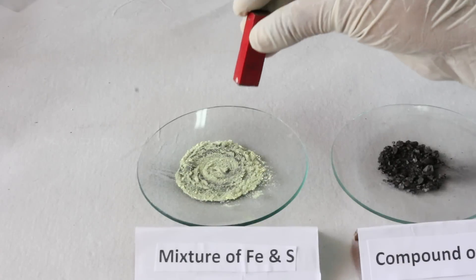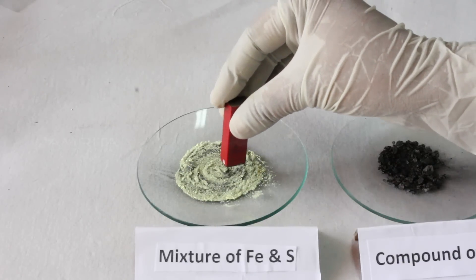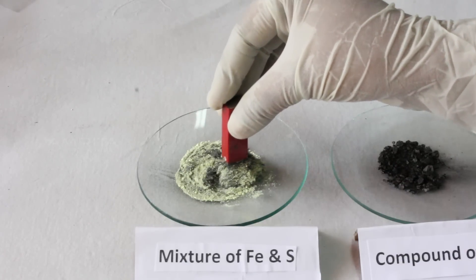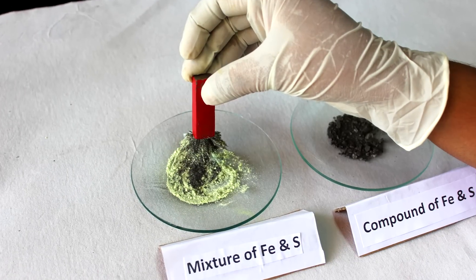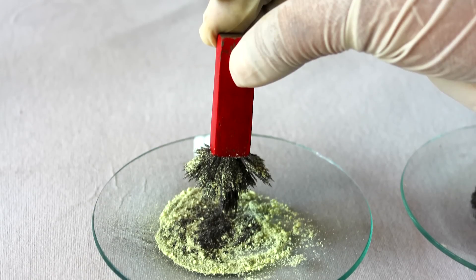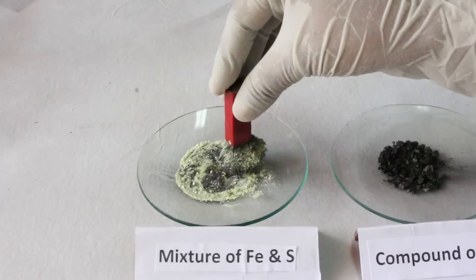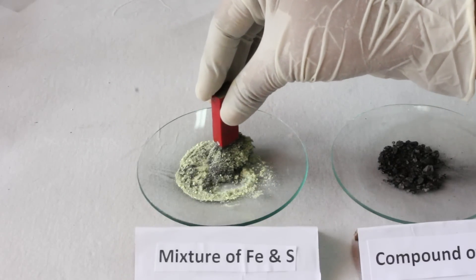Now, show a magnet over the watch glass in which the mixture of iron and sulphur has been taken. We can see that iron filings cling to the magnet, which indicates that iron retains its properties.